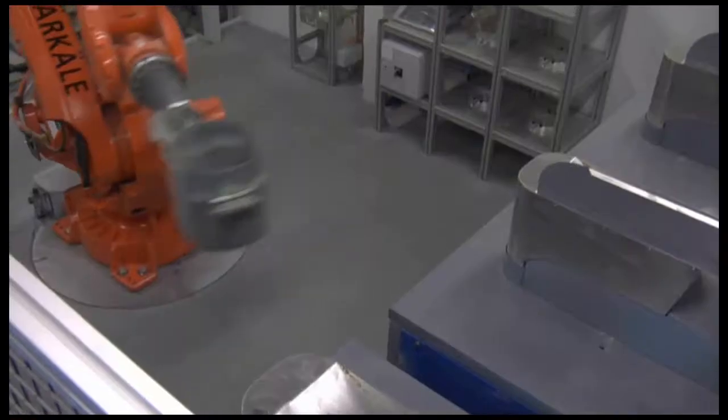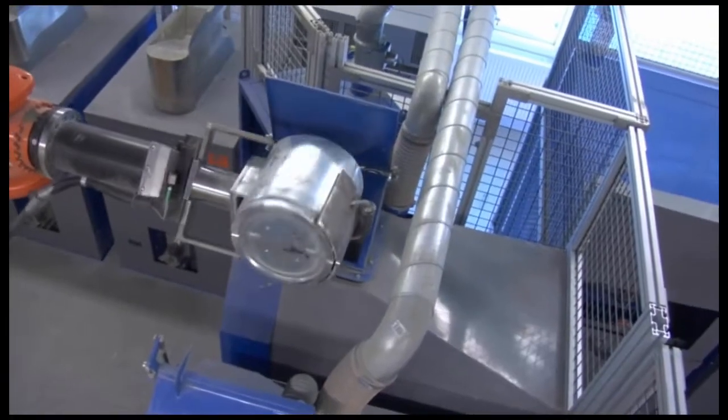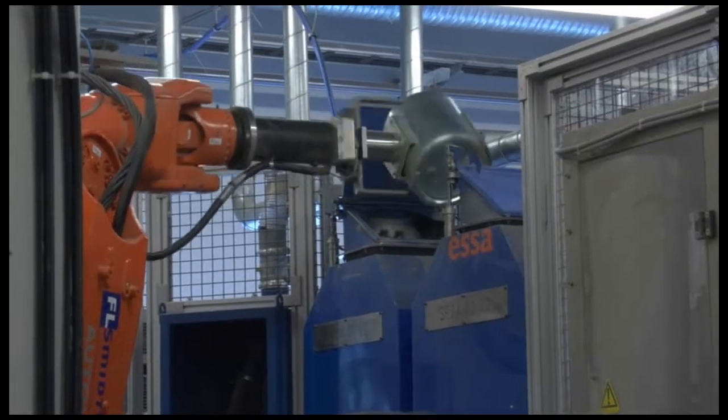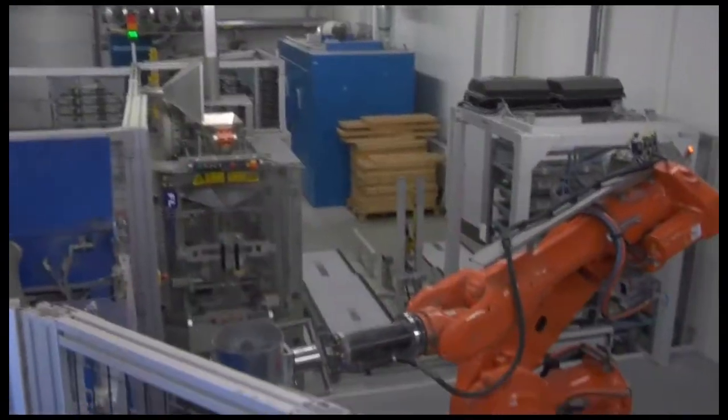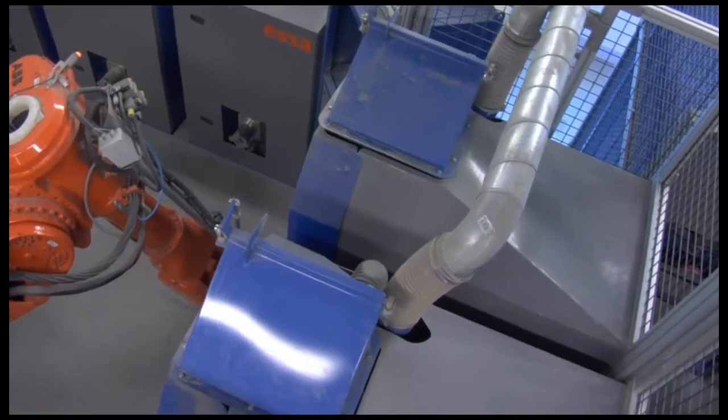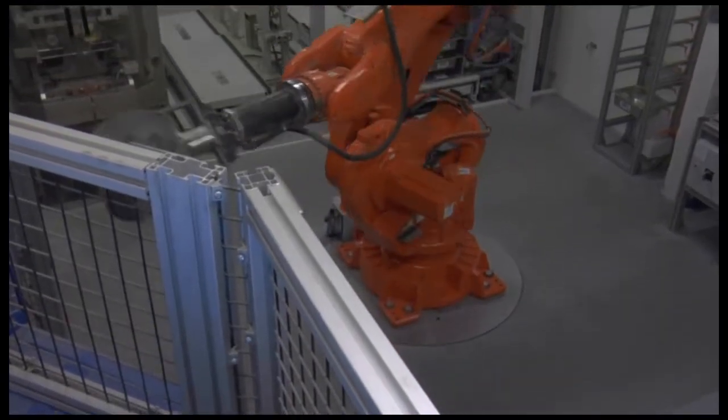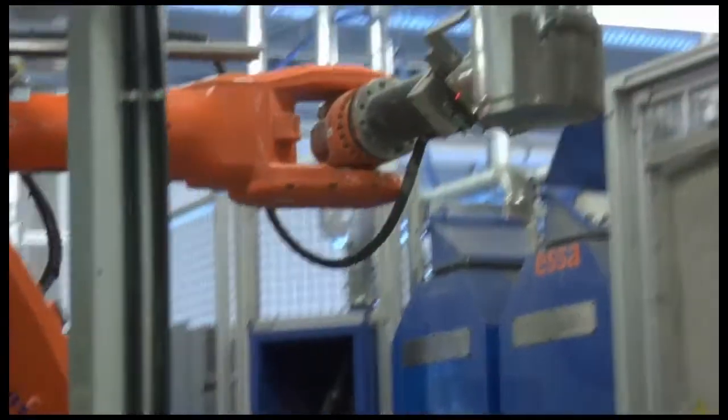One of two rotary sample splitters divide the sample into one portion for further processing in the pulverizing cell, and one archive portion that goes to the bagger, and the rest to reject. In order to avoid cross-contamination, both crushers and splitters are cleaned after each sample.